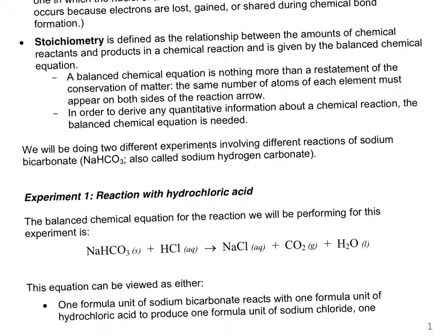So for both of the experiments, you're going to be using sodium hydrogen carbonate, or sodium bicarbonate. I'll let you know, this powder over here, I hope you're neater than I am. This is NaHCO3, sodium bicarbonate. Oh my gosh, you spilled. I did. But if you've ever brushed your teeth with baking soda, that's what that stuff is. We use baking soda in cooking, to brush our teeth, and to put on bee stings. Have you ever done that? Okay, that works, I think. That or cornstarch. But that's what that is.